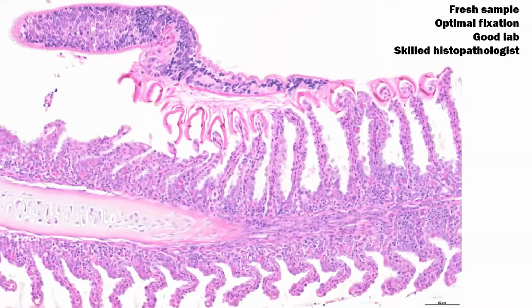When all the steps have been followed in the best way, this is the result. I believe that you also think that this image shows a very good histological preparation. And for the record, the image shows a specimen of Sparicotyle chrysophrii, for those who did not recognize it.